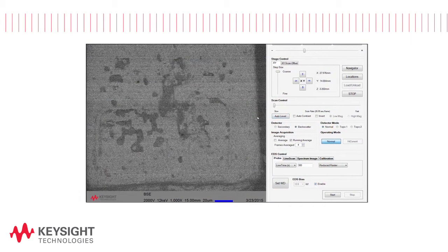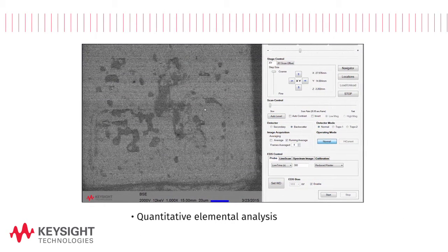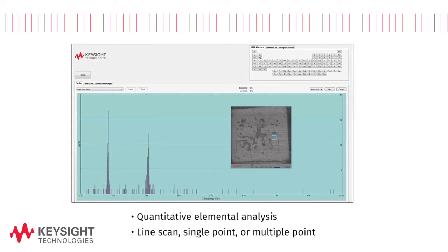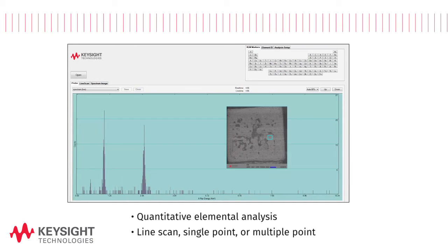The 8500B enables quantitative elemental analysis to be performed on a selected area, line scan, single point or multiple points via energy dispersive spectroscopy.